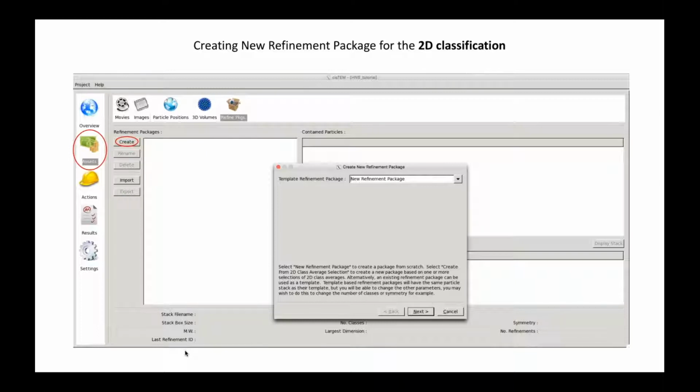The way the software decides it's a particle is by something that can fit in a certain box of expected size, and then a signal-to-noise ratio or something like that. Each program will perform differently. They have different algorithms behind them. The one that I like a lot, which I didn't show here, is a sort of new program. It has been very efficient for tilted picking, but in general, all these programs will pick well, unless you have problematic data.